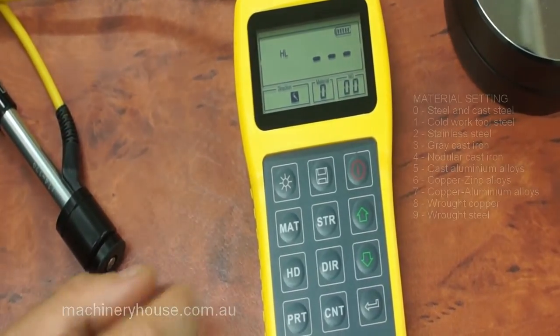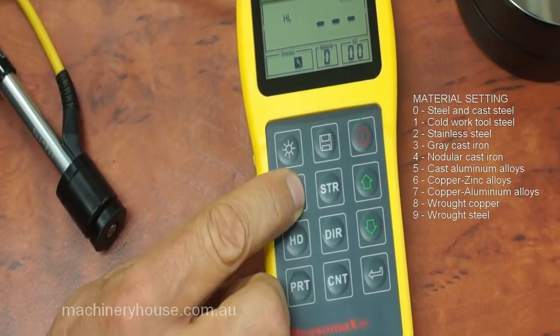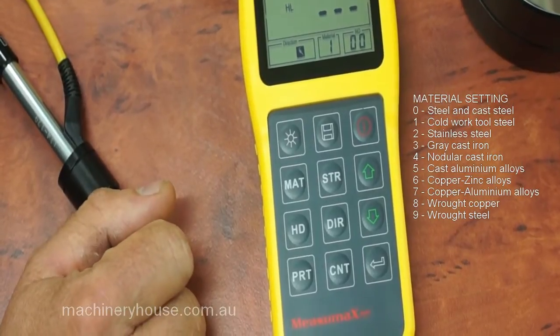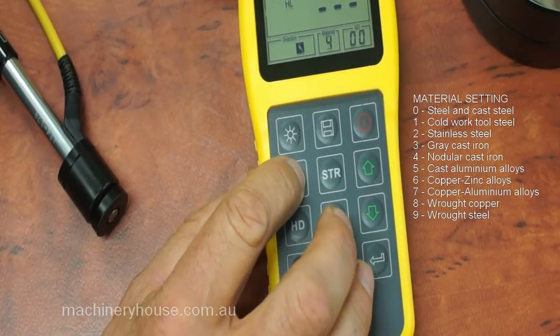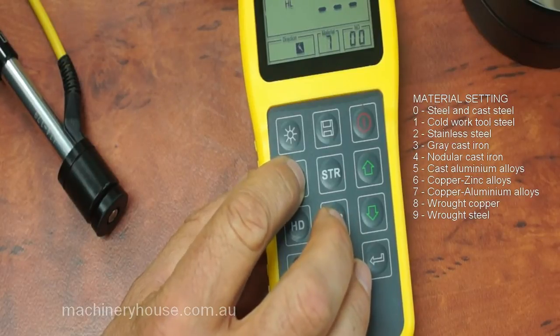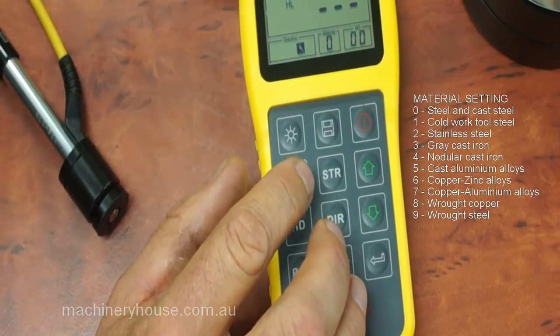Material button. Material setting. Press the mat button, pre-select the material you'll be testing. In this case, we are testing steel.